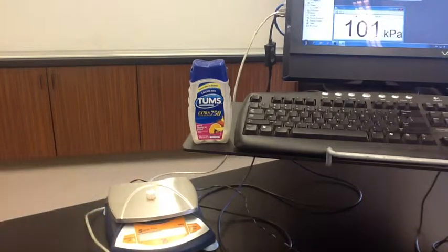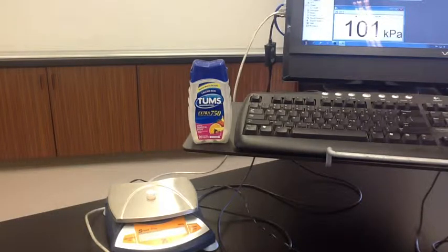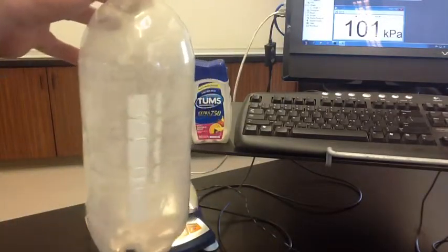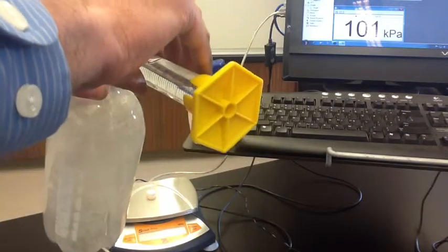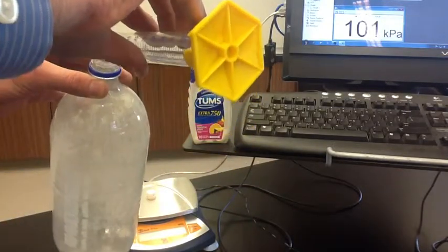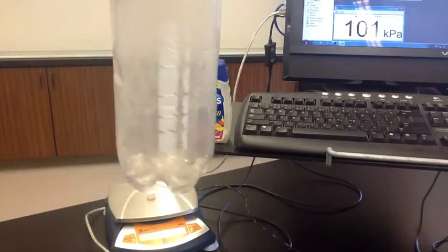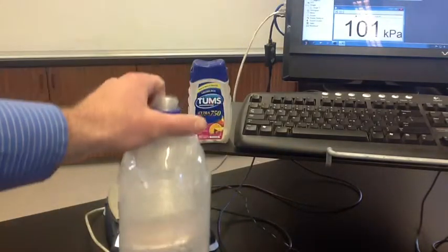We'll find the mass of these Tums tablets, and the mass of the Tums tablets is 3.9 grams. We're going to take a 2-liter soda bottle and put 50 milliliters of hydrochloric acid into it. This hydrochloric acid is going to represent stomach acid, and the 2-liter bottle is going to contain the gas that's produced during this reaction.